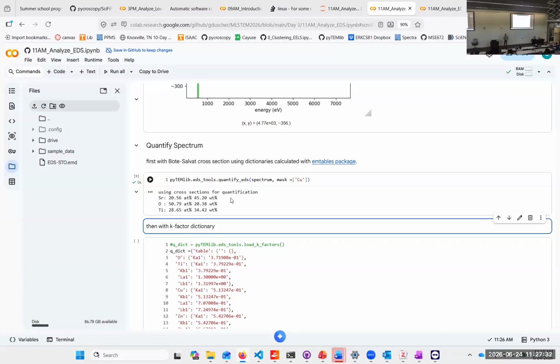So there are two different schools of references, but you can see that very easily, whichever element the K-factor is 1.0, that is your reference, right? So you have one with 1.0 and you're done. So the tabulated ones, let's see how accurate it is.